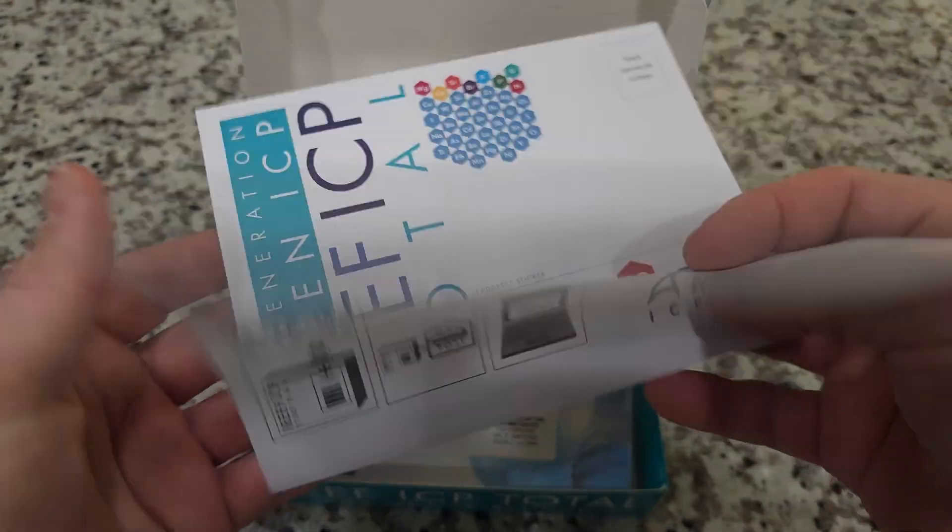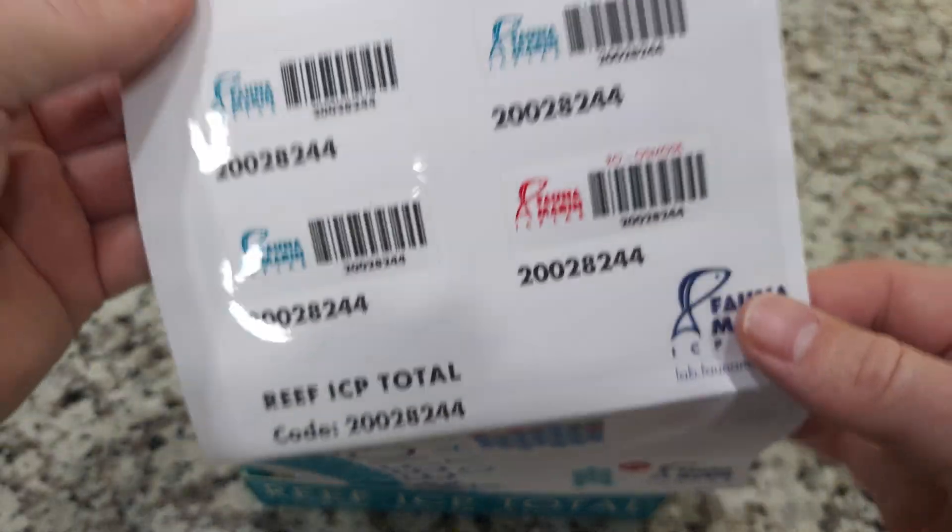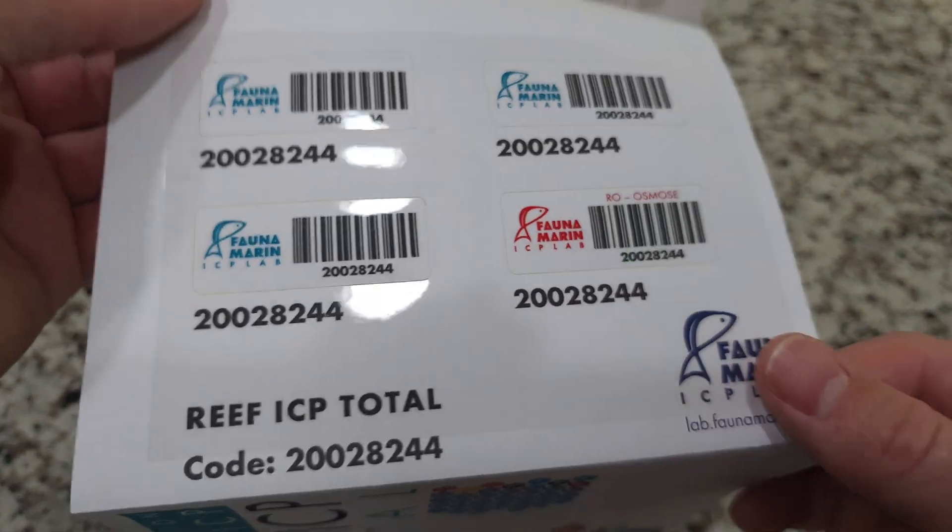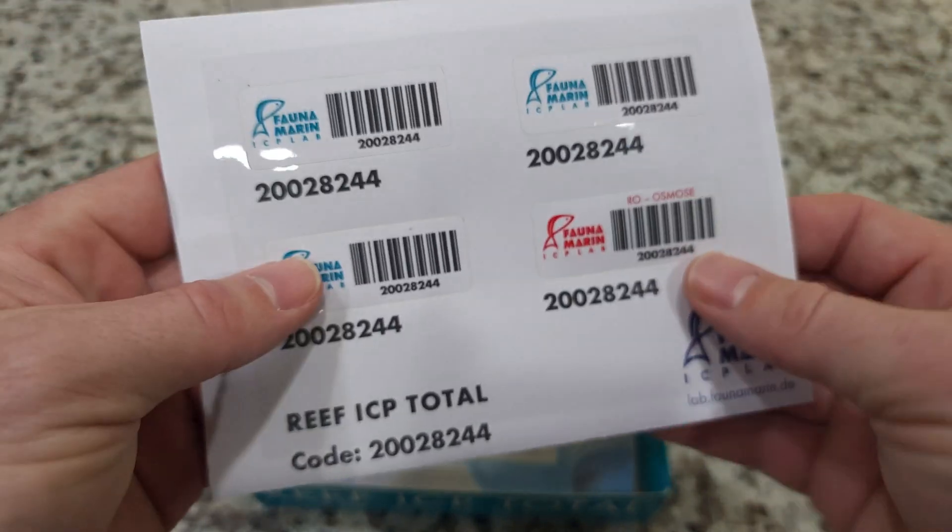It comes with the labels. If we open this up right here, on the backside are the labels that you need to label your vials with.